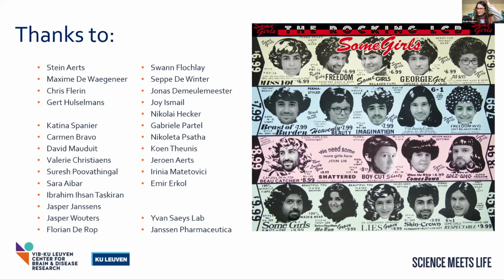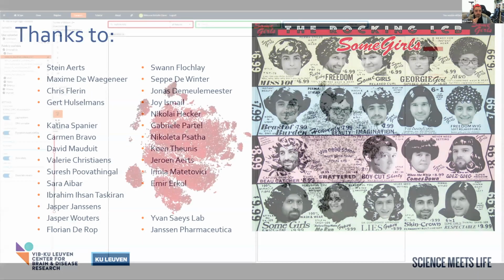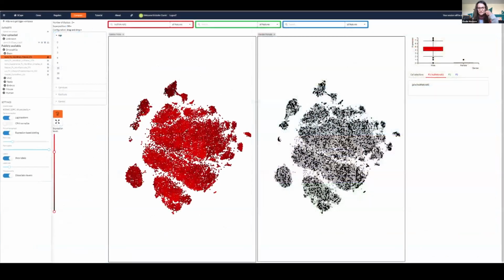Yeah, I have a question. First, thank you so much for Scope. I don't use the other one yet, but Scope we use a lot in my lab and people love it because it's really user-friendly. We use a lot of the compare tab as well. But I have a question about the thumbs up, thumbs down, if you can add annotation. So you mean that you can already share your data with other people? Because sometimes I work on projects where multiple people are working on the same data. I wasn't aware that you could share your data with some people.